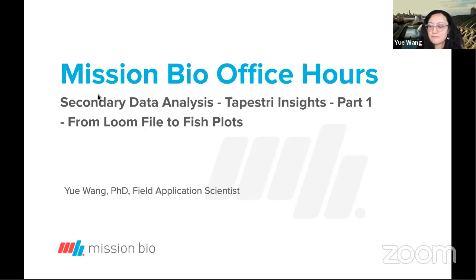Many of you might have already listened to the first session on primary data analysis using Tapestri Pipeline, given by my coworker, Jose Jacob. Today I'm going to talk about, after you get the loom files, how you would like to perform the secondary data analysis using Tapestri Insights. It is part one of a three-part series. So today I'm just going to give you an overview of how to use the Tapestri Insights software.